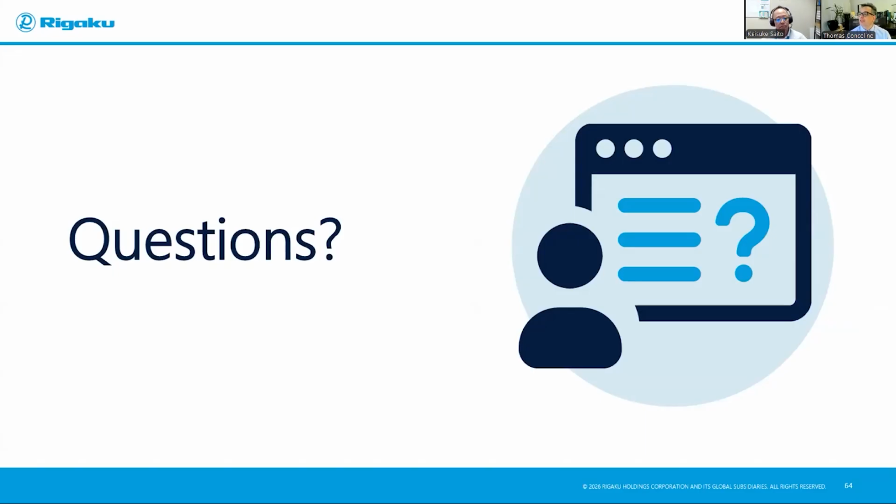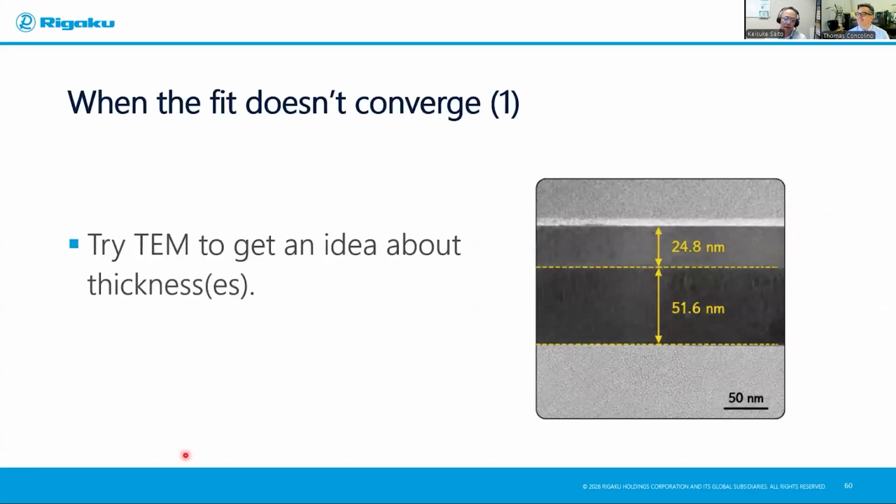All right. And the next one, which I think is a nice one as well, is: can XRR be used to measure the thickness of an amorphous polymer coating deposited on an amorphous substrate? Very good. Yes. XRR is like SAXS, right? In this episode I focused on scattering. Scattering means we don't have to have a crystal structure, so amorphous or crystalline thin film, either way is fine. But we need to have a density contrast between the layers.